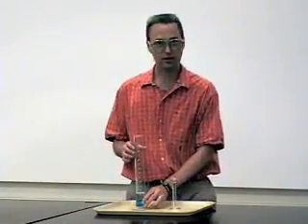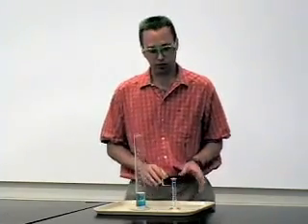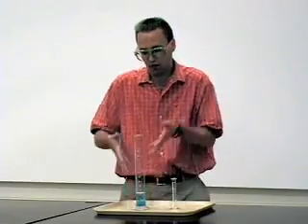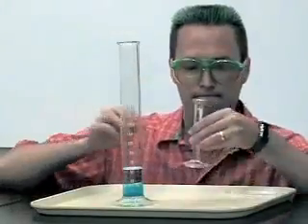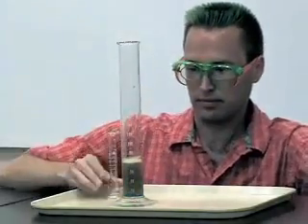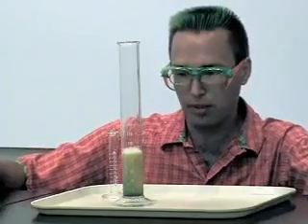What I have here is some hydrogen peroxide and some sodium iodide, which is kind of a salt thing. Mix the two, and this should create a lot of bubbles of oxygen over here, and it'll foam up and be all really cool and exciting and be wicked fast. All right? Ready? Here goes nothing. Oh yeah, look, there it is. It's bubbling. Ooh, bubbling away.